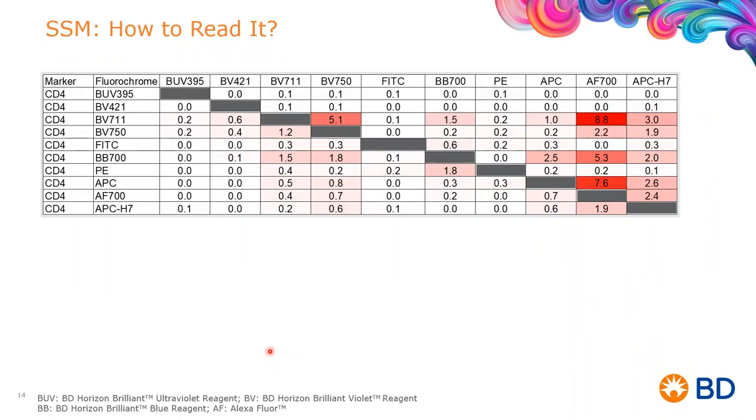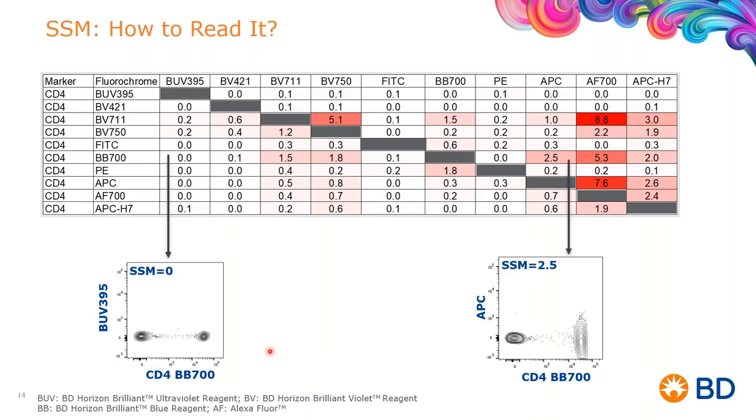How do we read it? And this is very important. So let's take a minute here. We see these from multiple vendors, multiple scientists being used as the assumption is that a higher value of spread matrix correlates with a higher amount of spread.